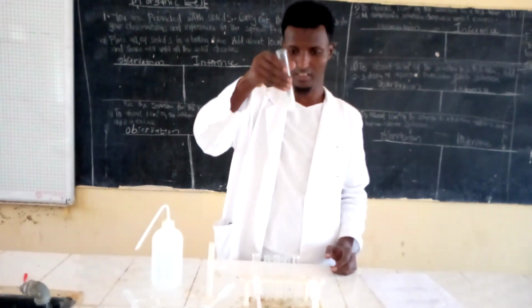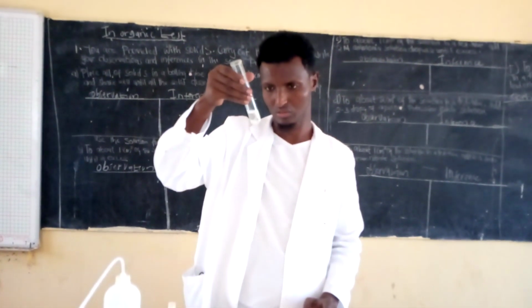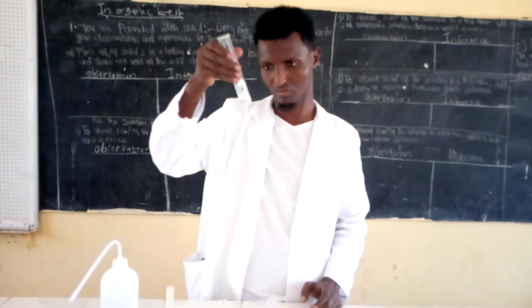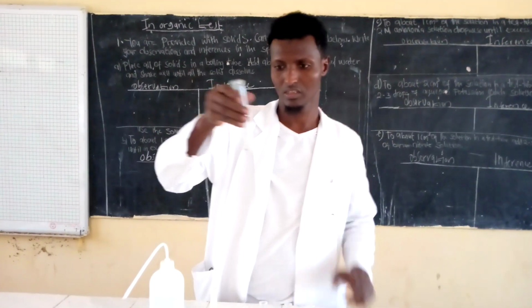We want the solid to dissolve, because we can't carry out our experiment on a solid. We want to have a solution. So the solid must be dissolved so that we can carry out our experiment.